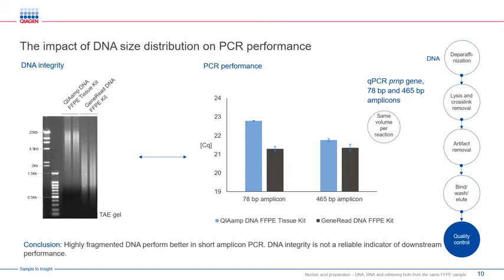And with respect to sequencing, since we are looking at a 465 base pair amplicon here, you can also probably agree with me that this is easily long enough for all the standard NGS application or library preparation protocols. So this is not really limiting in any way.